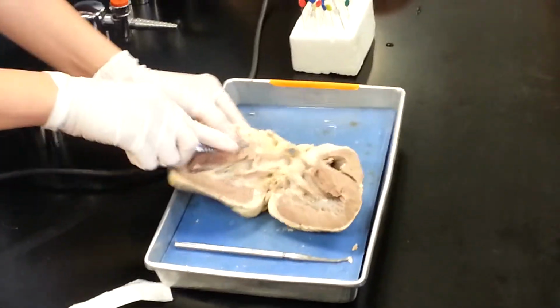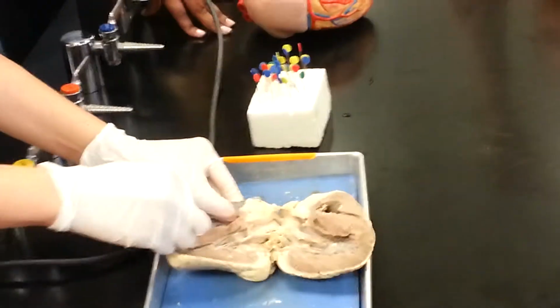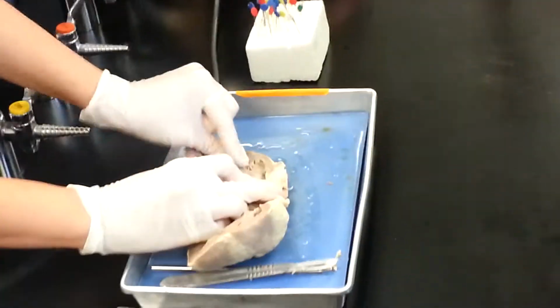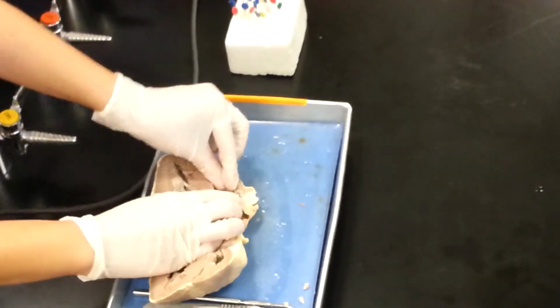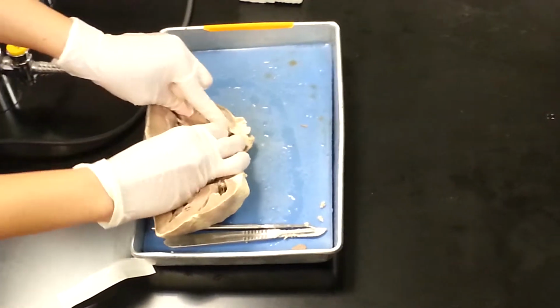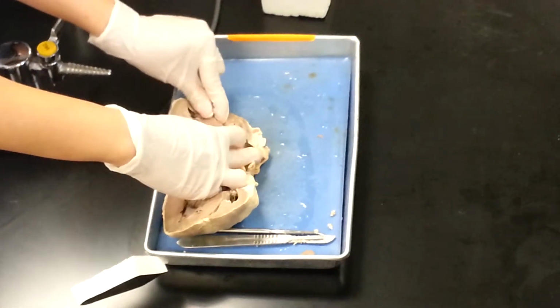Pectinate muscles, right? So if I just keep slicing, maybe we'll get to it. So I just cut through that auricle. But yeah, here, you can really see this. This is the atrium here, the right atrium. You can tell because there's this valve attached to the chordae tendineae, attached to the papillary muscle, and above the valve is always the atrium, below the valve is always the ventricle.